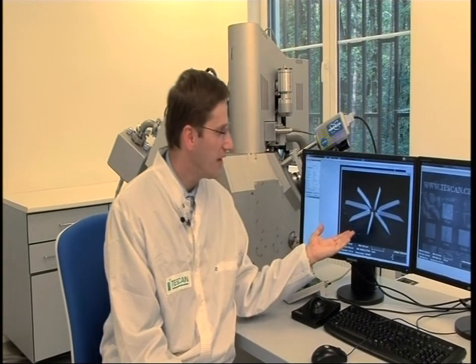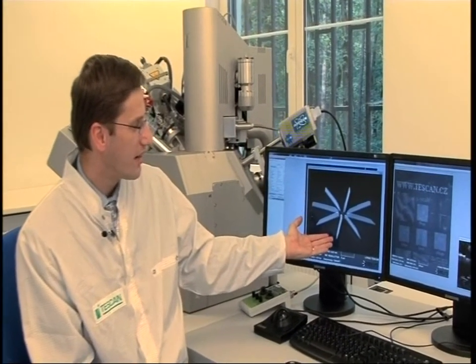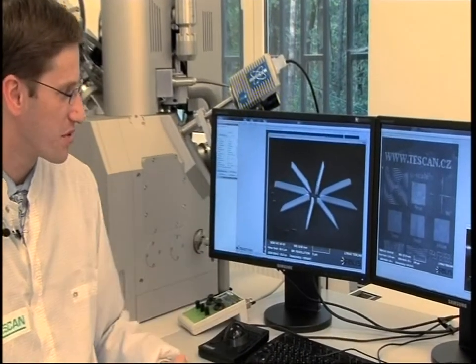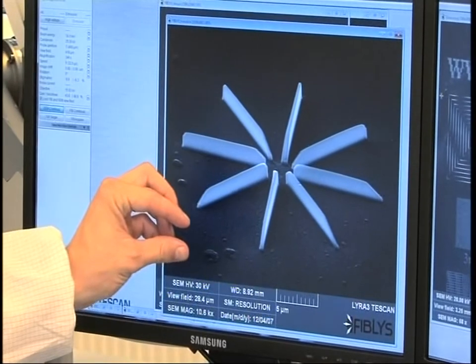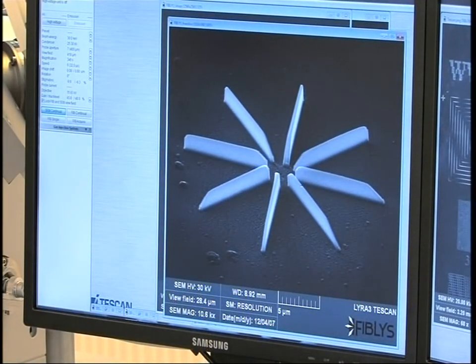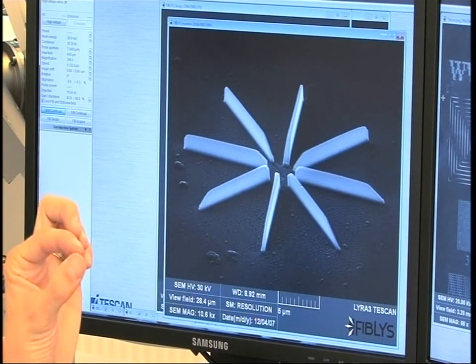In the third example, we can see a structure which has grown on a substrate. Here is what it is. We release gas into the environment of the sample. In this case, a compound containing platinum. And using the ion beam, we break this compound.